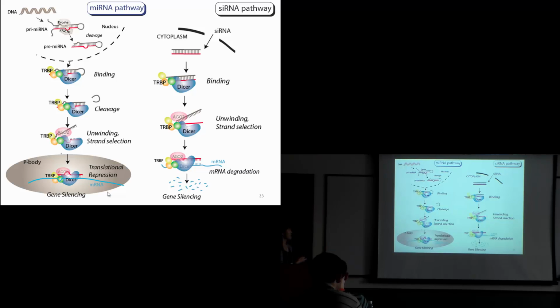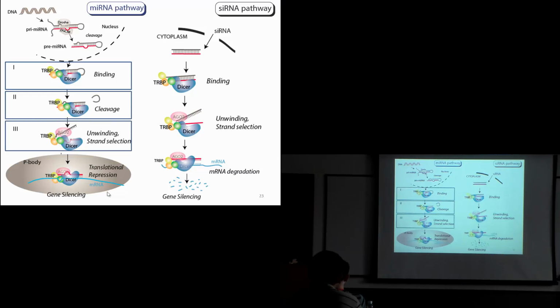Okay, so our assay, I don't know how far I'm going to get. I'm just going to stop when my time comes to stop. So we devised stages, single molecule, pull down, and single cell stages, to quantify each step of the way. And again, our idea is that by designing the RNA substrate with some better logic, perhaps we can have better efficiency at each step of the way that leads to efficient silencing.